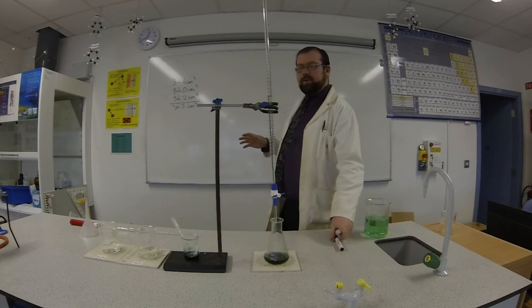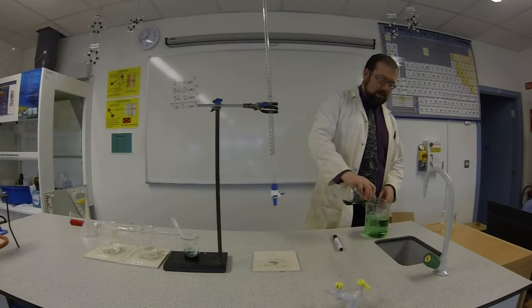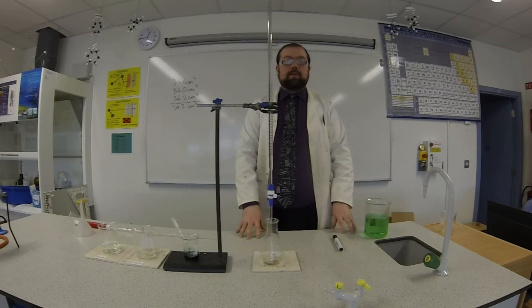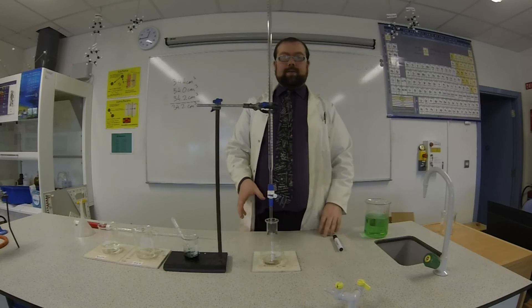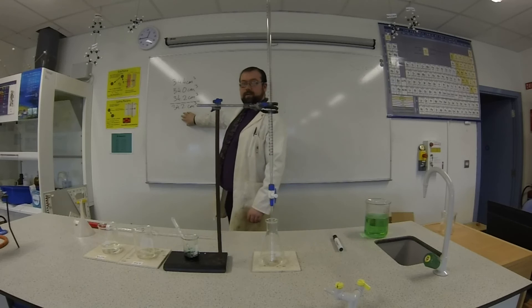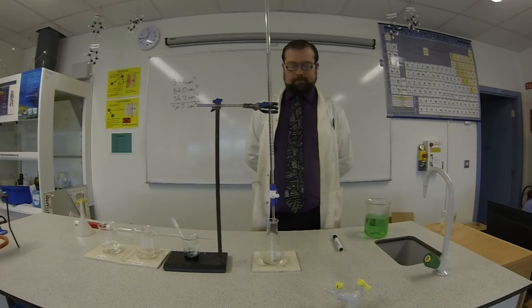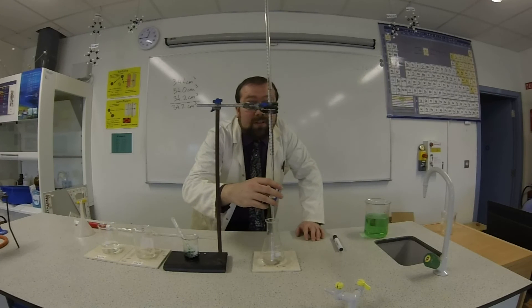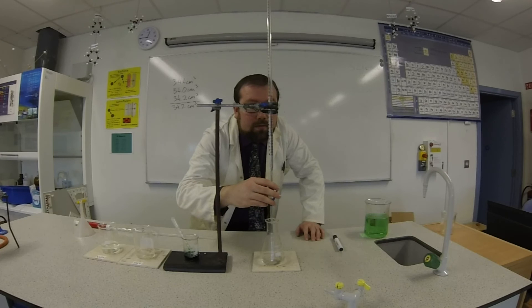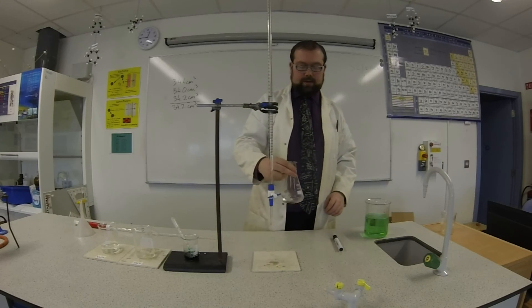So what I'm going to do is average all of these — that's going to be 34.2 cm³. So it's pretty much 34.2 cm³ that will get us a neutral liquid. Now I have to do this one more time. I'm going to do it without an indicator because we have to prepare a sample of salt, and we don't want green or blue or red salt — we've got to get pure salt. For my final titration I've got no indicator in here. I've worked out that it's around 34.2 cm³ of acid that will give me purely neutral salt and water. Make sure you look dead on at your burette and keep it vertical. There we go — 34.2 cm³. So hopefully now this is neutral.